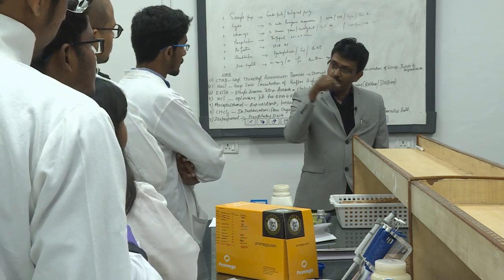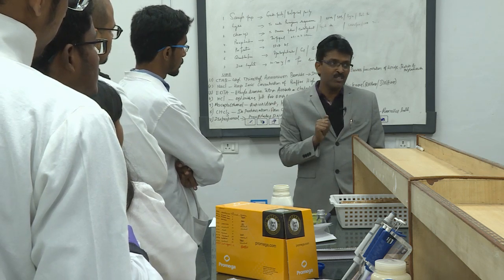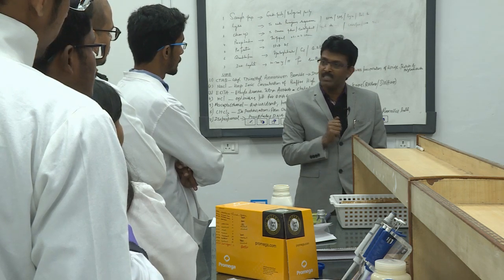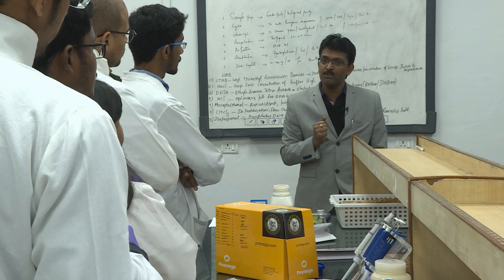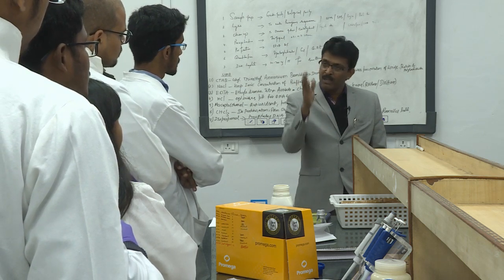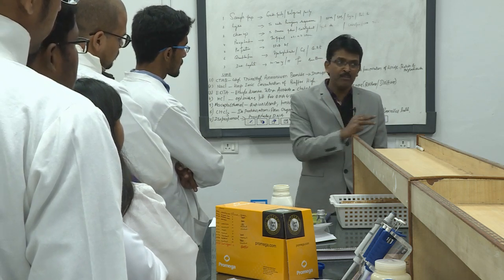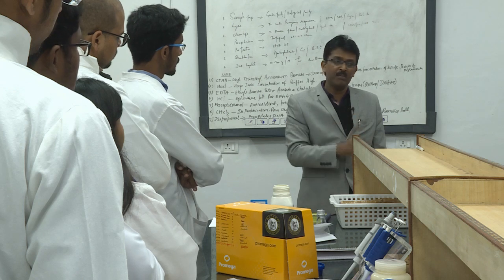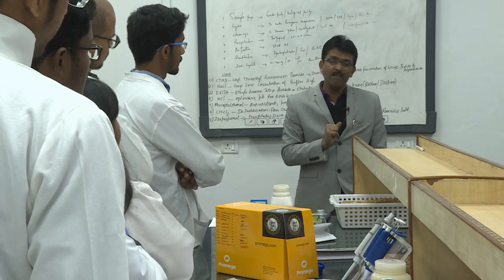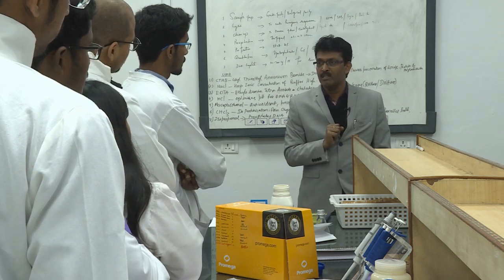So, remember, the plate is coming from a single spore, and a portion has gone for this preservation, another portion has gone for sequencing efforts. The whole genome, what we did for Magnaporthe, we have preserved like this. The same genetic material, half of the material has gone for genomic DNA isolation and PacBio library and Illumina library and sequencing. The same biological material has gone for long term preservation in filter paper, kept at -20 as a long term culture.